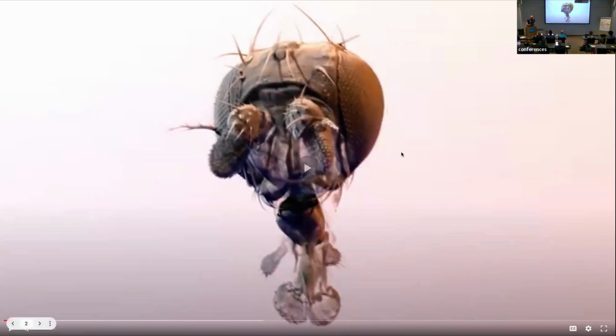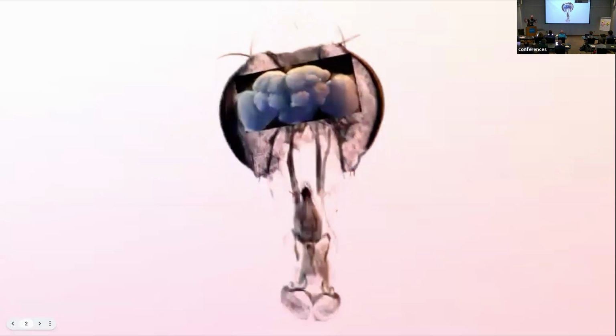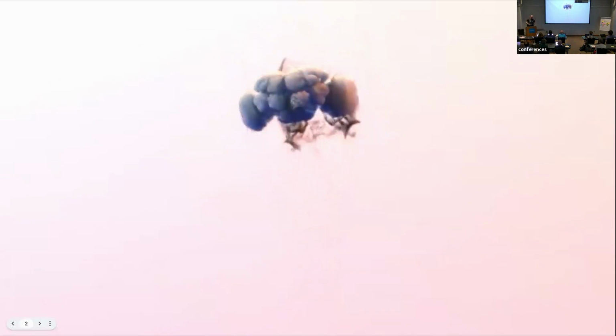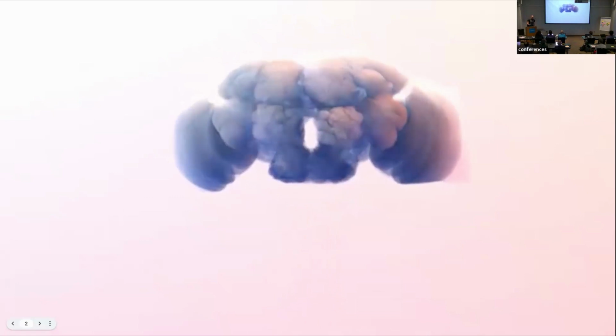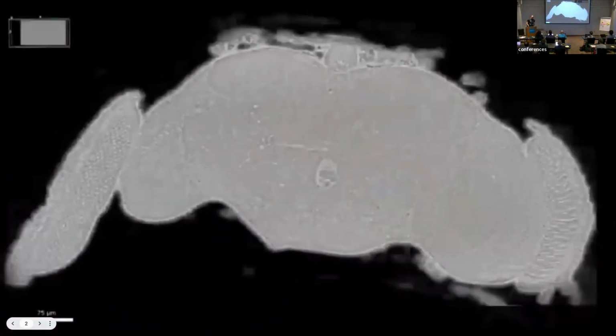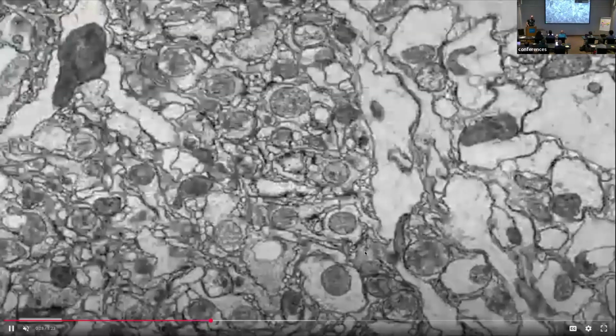And we will now slice through this head. And then we see the brain that sits nicely mounted between the two eyes, which is clever. And then we will see how this EM data set slices through this brain as we're zooming in. And then following that, we will zoom into the EM data set. And if that weren't compressed by Google so dramatically, you would see some stuff.